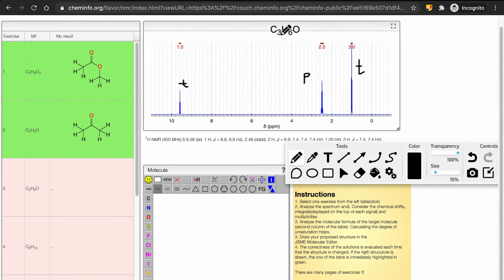So remember, it has the same molecular formula as the previous question, so it's going to be very similar. The most unique aspect of this spectra is the peak here above 9 ppm, in between 9 and 10. And for these sorts of interesting chemical shift values, it's good to have a table. There are many tables that show chemical shift values.